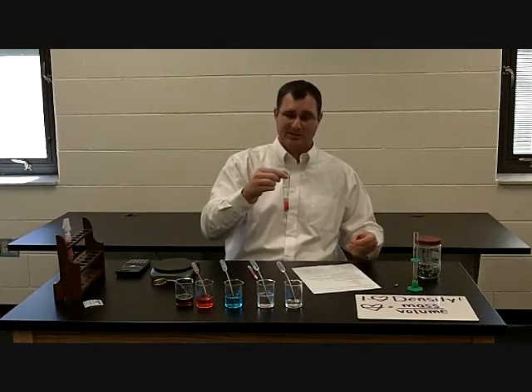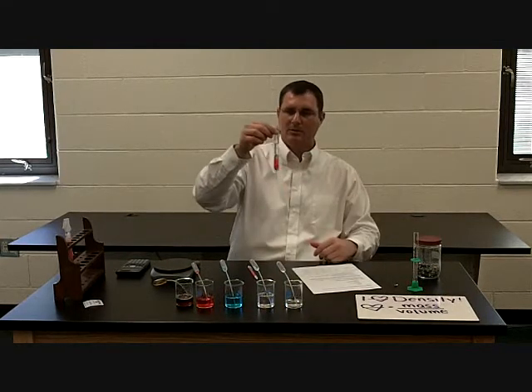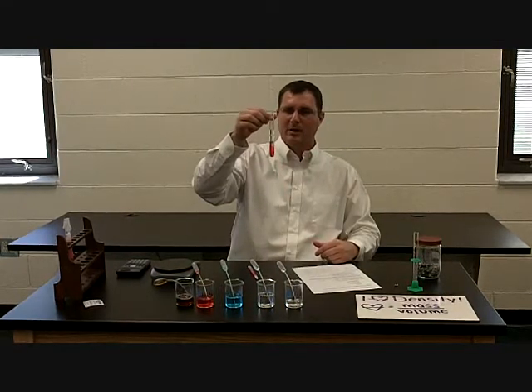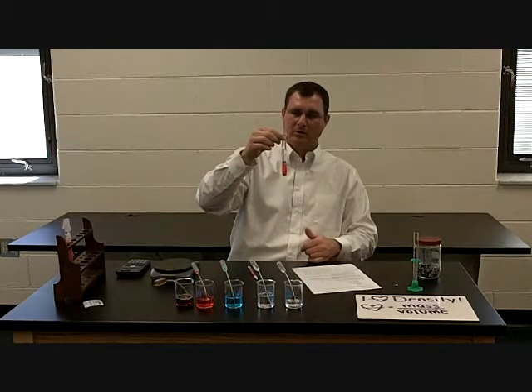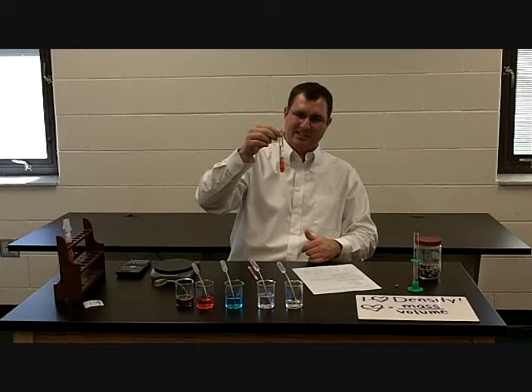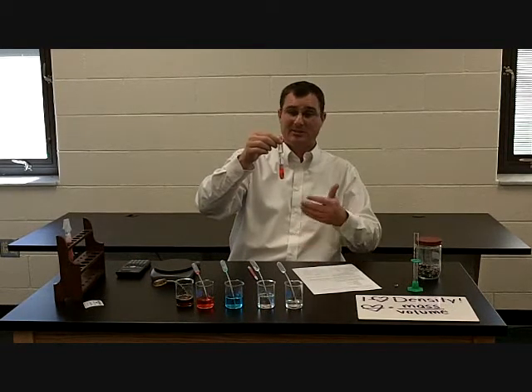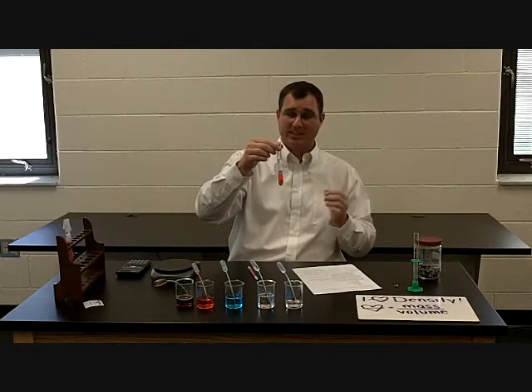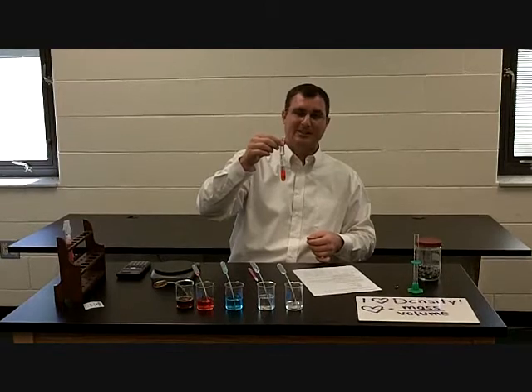Okay. Now, the next thing I'm going to do is put a couple beads on there. So let's put a couple beads in there and let's see what happens to them. Well, that one sunk right through the alcohol, right through the oil, and right now it's sitting on top of my Windex. So that means it's more dense than the alcohol, it's more dense than the oil, but it's not quite as dense as the Windex.